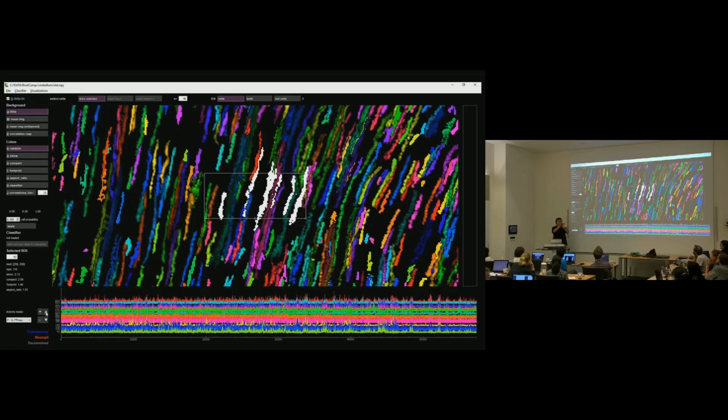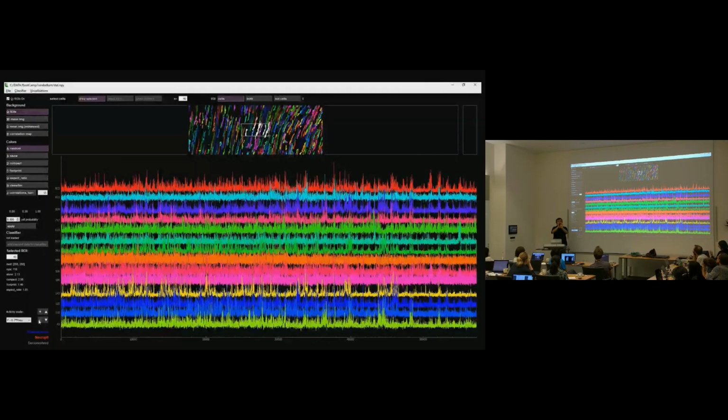So if on some frames you've got your cell moving, I'm going to stop this, it's distracting. That creates a lot of correlations between pixels from the frames that they're inside. Basically at the edge of whatever ROI you have, there'll be a lot of variance because the pixel will go up and down depending on whether it's inside the cell or outside. And that can just be all because of motion. And so that creates a lot of variance. You'll see it as ROIs that are close to each other and almost like shadowing each other. You'll tend to get a lot of those, especially if motion registration failed. It won't fail just for one ROI. It'll fail basically for all of them.